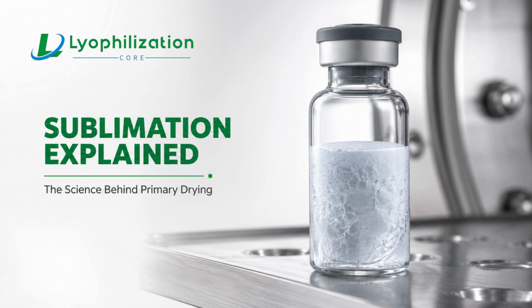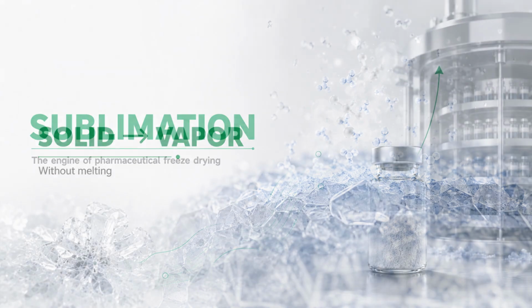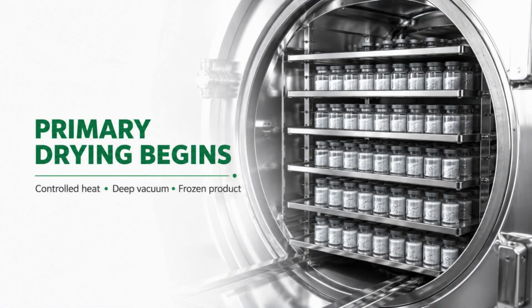Imagine removing frozen water without ever allowing it to melt. It may sound impossible, but this is exactly what happens during pharmaceutical freeze drying. Instead of becoming liquid, ice transforms directly into water vapor. This process is called sublimation, and it is the driving force behind primary drying.